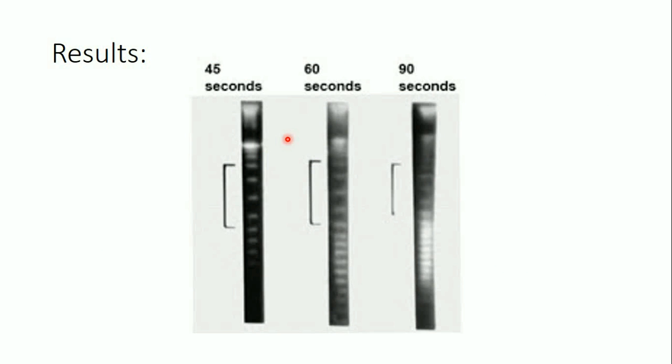Here is an example of PFGE results from the same sample run with different switching times. At 45 seconds switching time, smaller fragments are better separated but larger fragments are not perfectly resolved. Increasing the switching time gives better resolution for larger fragments. At 90 seconds switching time, very large fragments are perfectly separated, while small fragments are less well resolved. This illustrates how the parameters directly affect the separation results.